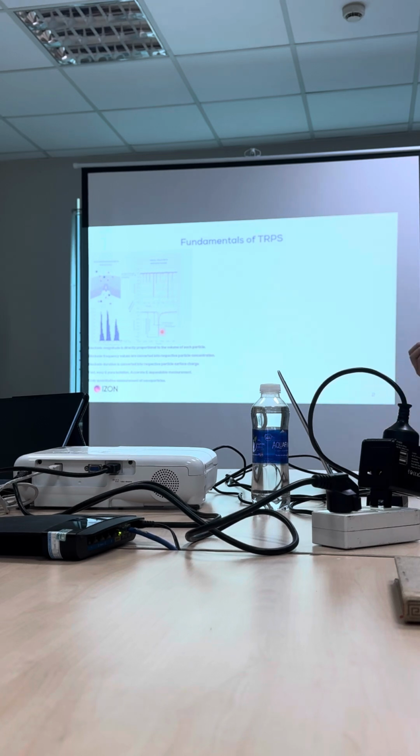So you need to measure the zeta potential and maintain it at larger than 30 millivolts. We know that if the value is larger than 30 millivolts, it is stable in the solution. For example, if it's just 10 millivolts, it will form aggregates very soon, maybe in half a day, 1 day. So that's the device function, used to measure the size, concentration, and the zeta potential.